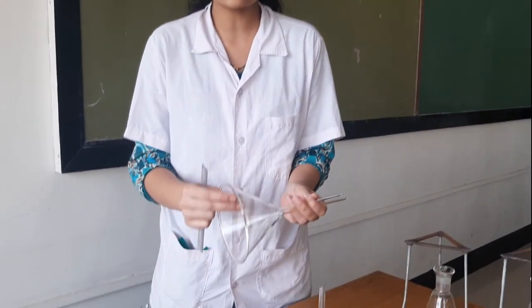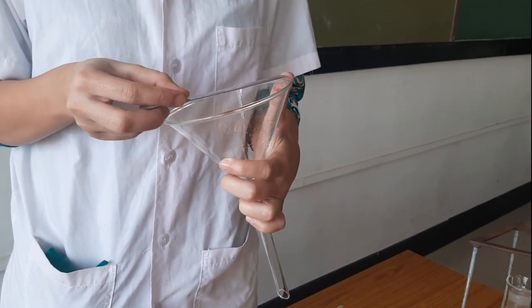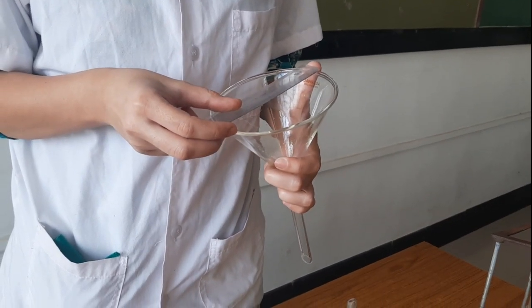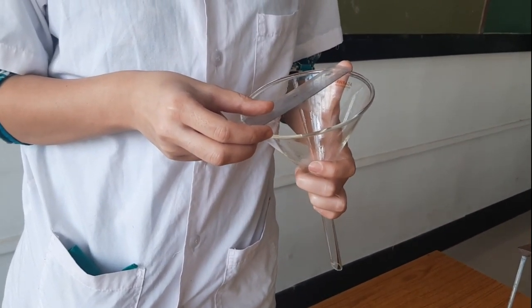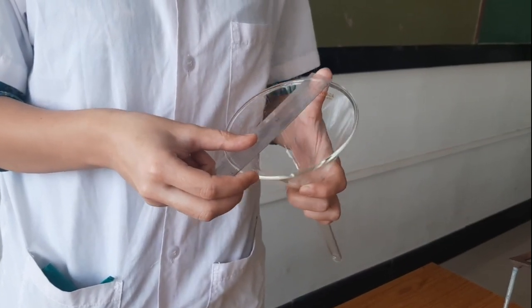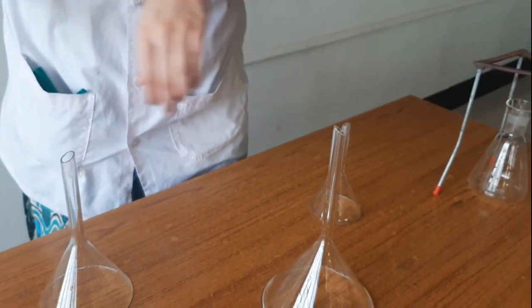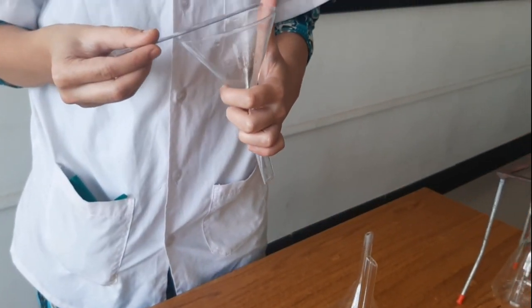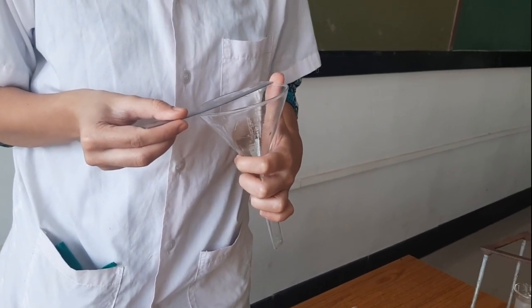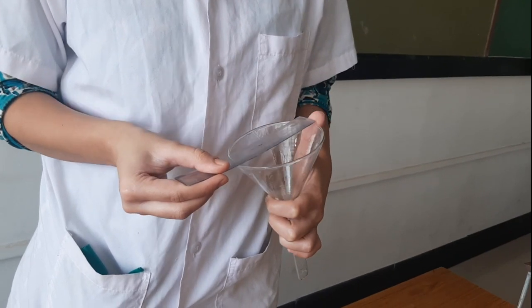First we will see the diameter of this particular funnel. The internal diameter of this funnel, our biggest funnel A, is exactly 12.2 centimeters. The second funnel, B, is exactly 9.6 centimeters.